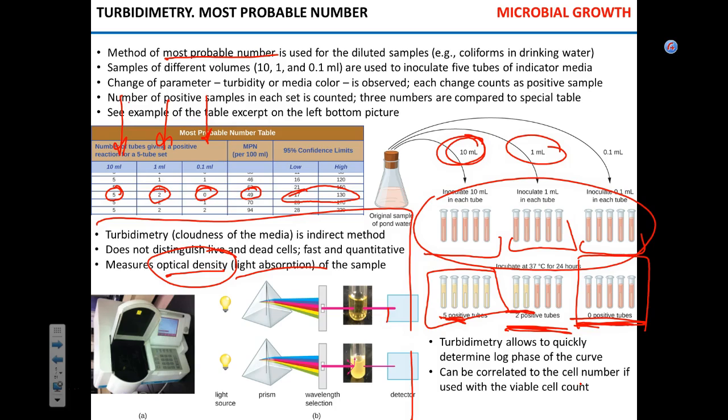For a given 100 mils, can we have 25? Yes. Can we have 90? Yes. If we compare probability of having 90 to having 49, what is more probable? Having 49. That's why we call it most probable number. Does that make sense? So if we try to plot the probability, it's going to be this. So this is 49, and those are other numbers. We still may have them.